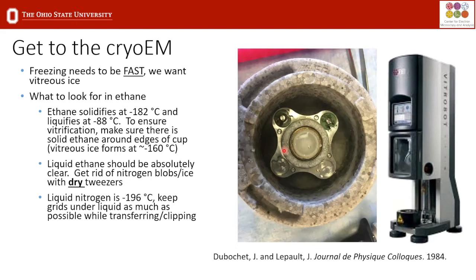Also, check the top of your ethane. It should be completely clear. If you see any bit of cloudiness or some ice crystals floating around, what I do is dry off a pair of tweezers really well with a hair dryer and then just pluck at those bits of contamination to try to get a perfectly clear window of liquid ethane.